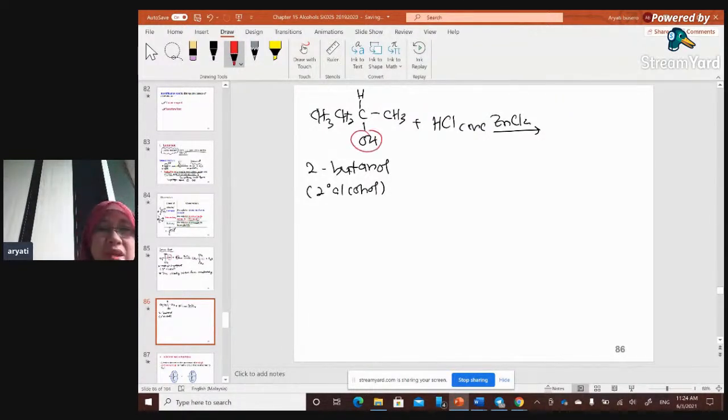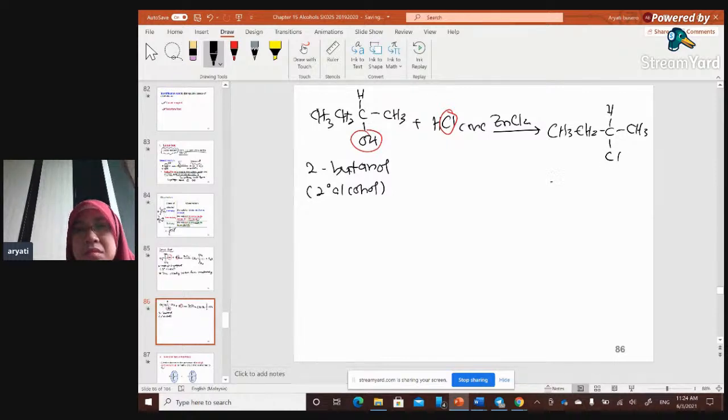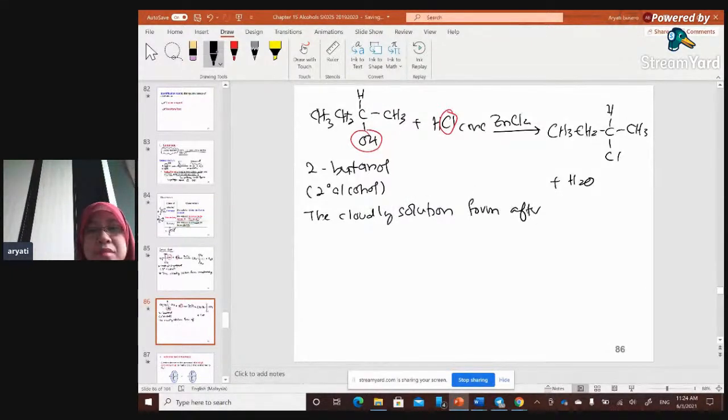OH is substituted with Cl. Your observation is that the cloudy solution forms after 10 minutes of heating.